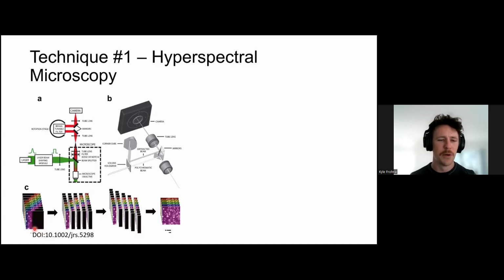So what you effectively do is you slowly step in small, well-known intervals the angle that the Bragg grating takes with respect to your light, and you will sweep out the spectrum of light across your sample. If you know that for a given angle of the grating, this is, for example, violet, then you change the angle, this becomes violet, and this becomes violet, etc.